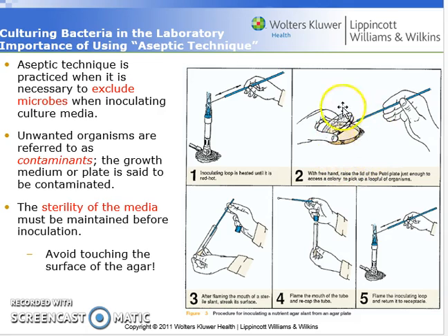Wherever you touch this Petri dish, as long as you have bacterial cells on your inoculation loop, you're going to get bacterial growth. There's really no way you can mess that up, unless your loop is too hot when you collect your sample, and you kill the bacteria so they don't transfer over. So you get your sample, and that's what's being demonstrated here from this plate.